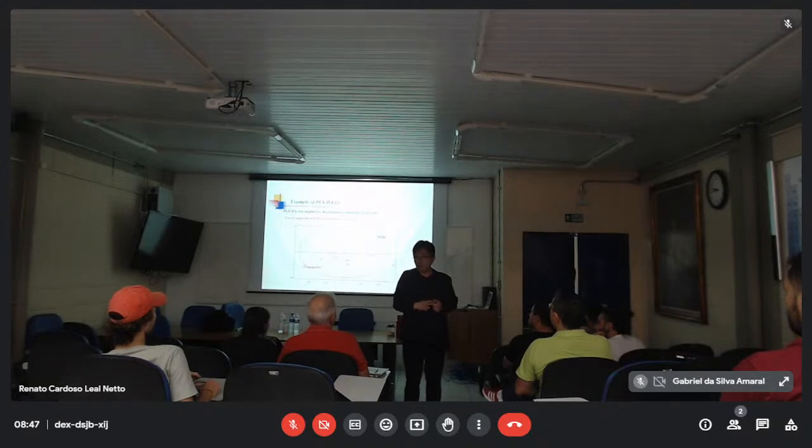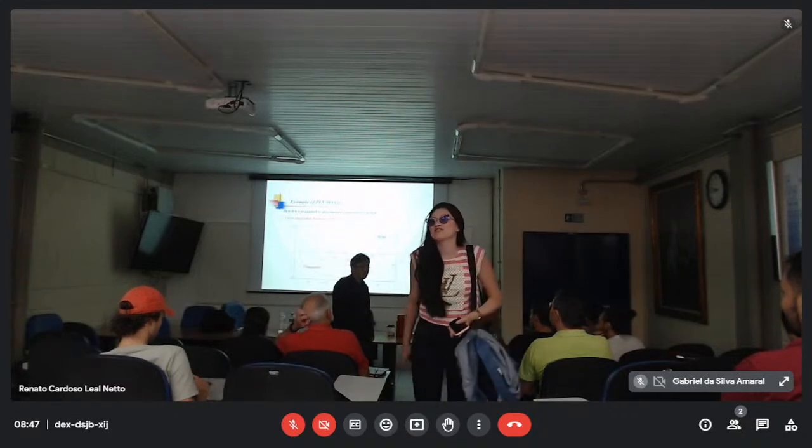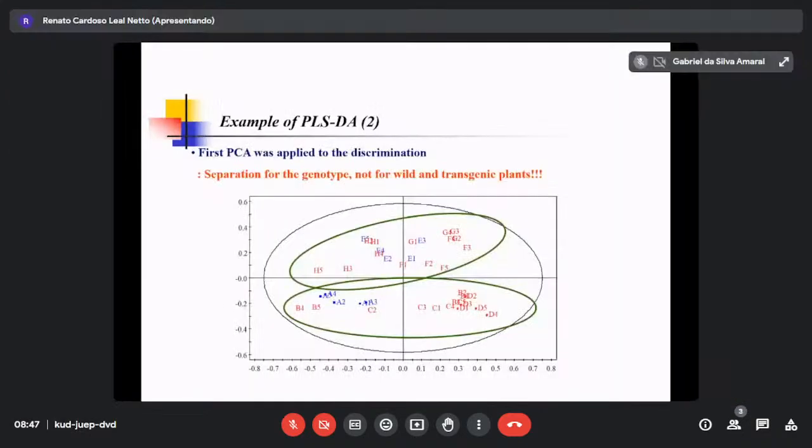The second important one is principal component analysis. Sometimes many people, like me, draw a circle. But as I mentioned, in the strict sense, principal component analysis itself is not statistical. You should not put a circle because it can give a prejudice. But to show in the paper, maybe you can draw the conclusion.